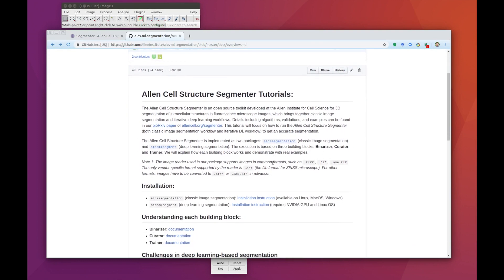To use the deep learning part of this package, we assume an NVIDIA GPU has been set up properly on a Linux operating system. Make sure to follow the installation instructions on our GitHub page to set this up before starting.